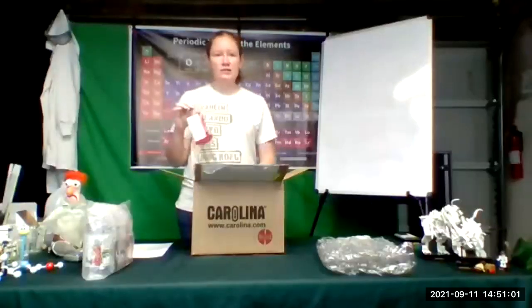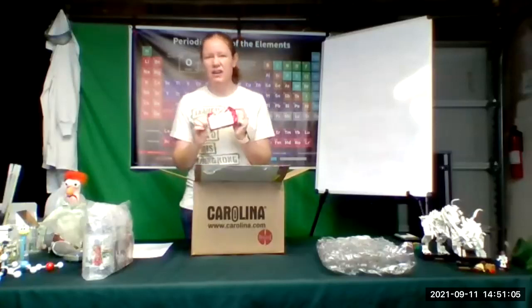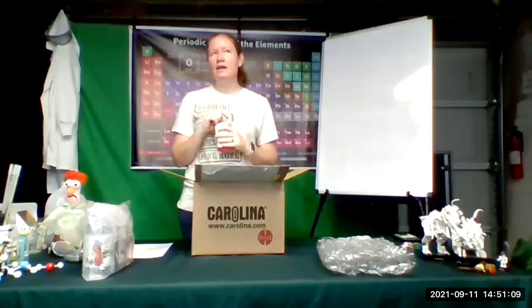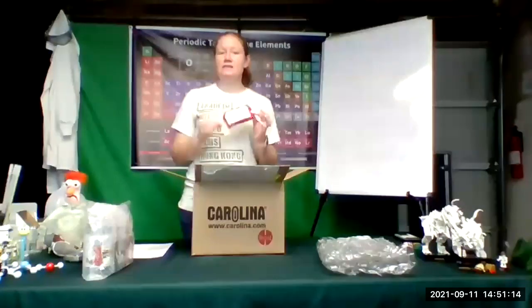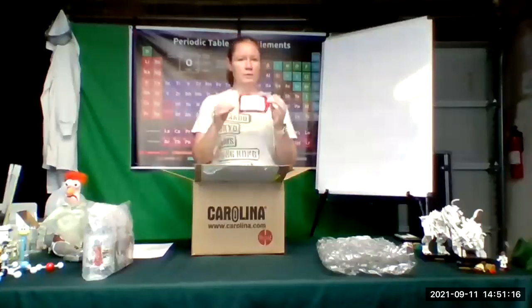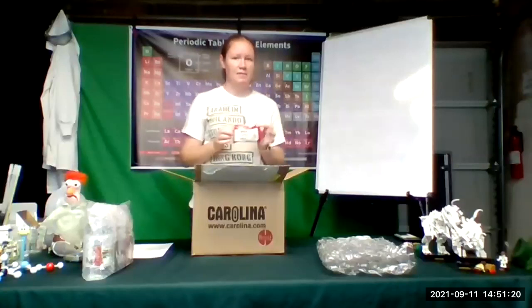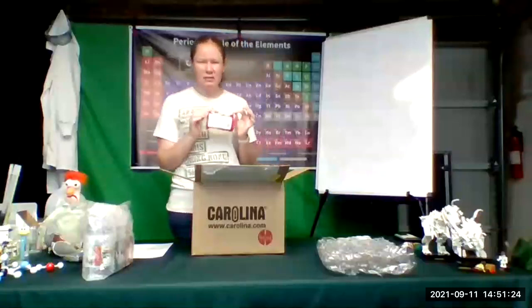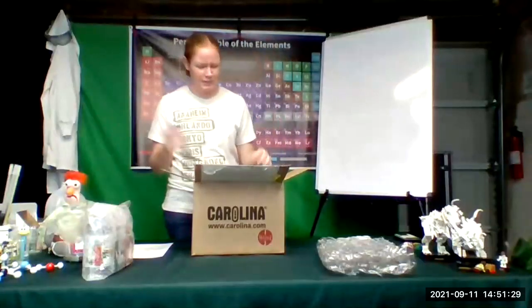Okay, you're going to get a bag of balloons that says introduction to molecular bonding. We're actually not going to use the balloons. These you'll see when we do our molecular geometry chapter, you'll see a slide that shows balloons blown up to show the basic molecular shapes. And these balloons allow you to do that same thing. So if you want to recreate those yourself, you can, but I'm not going to make you do that. But you have the balloons if you want to use them. If you want to use them for something else, that's fine.